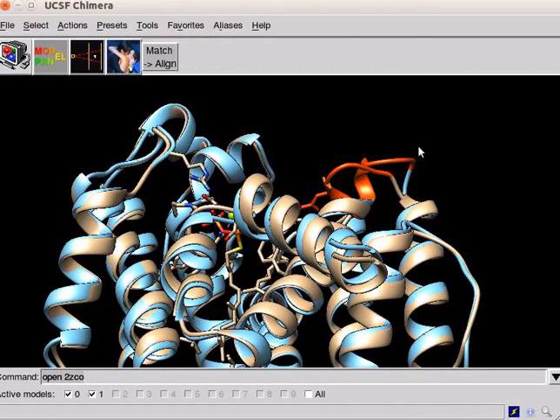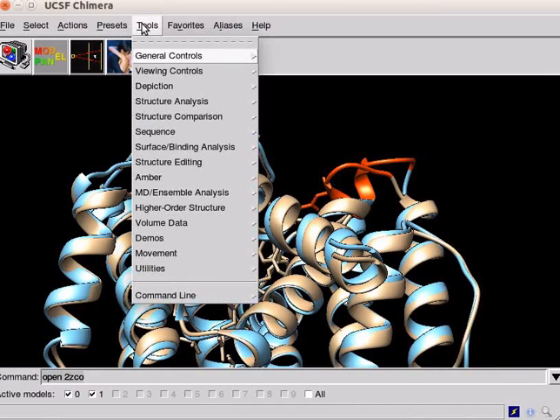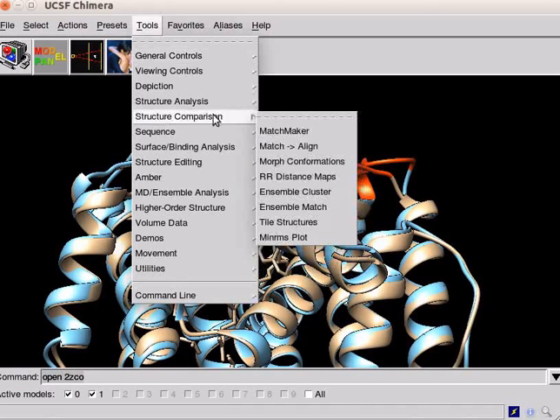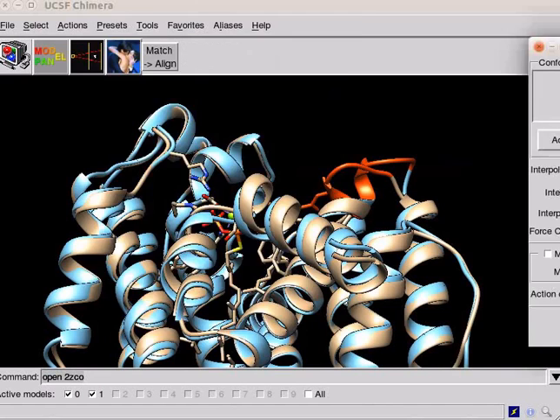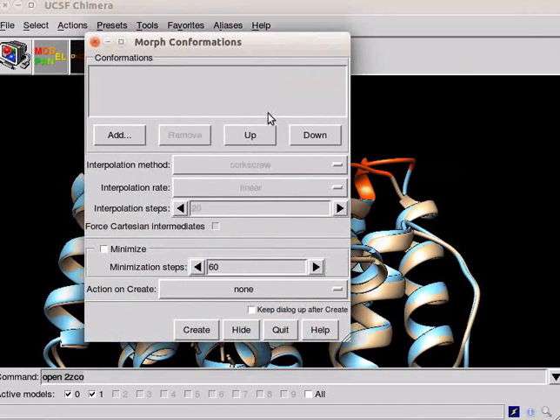Back to the panel. Start the morphing tool from the tools menu. Click on the tools menu. Scroll down to structure comparison. Click on morph conformations option. A morph conformations dialog box opens.